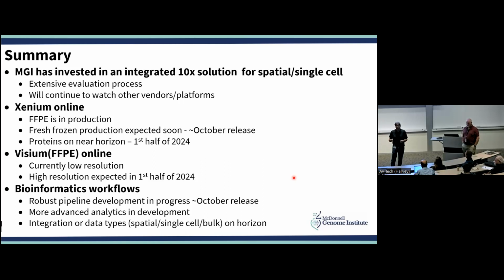So if you're looking for a lot of lowly expressed transcription factors, you might be better off looking for the things those transcription factors activate and drive, because those signatures will probably be easier in a lot of cases to pick up than the low-level transcription factor. Not always. Sometimes you do get transcription factors, but you're not going to necessarily count on that.